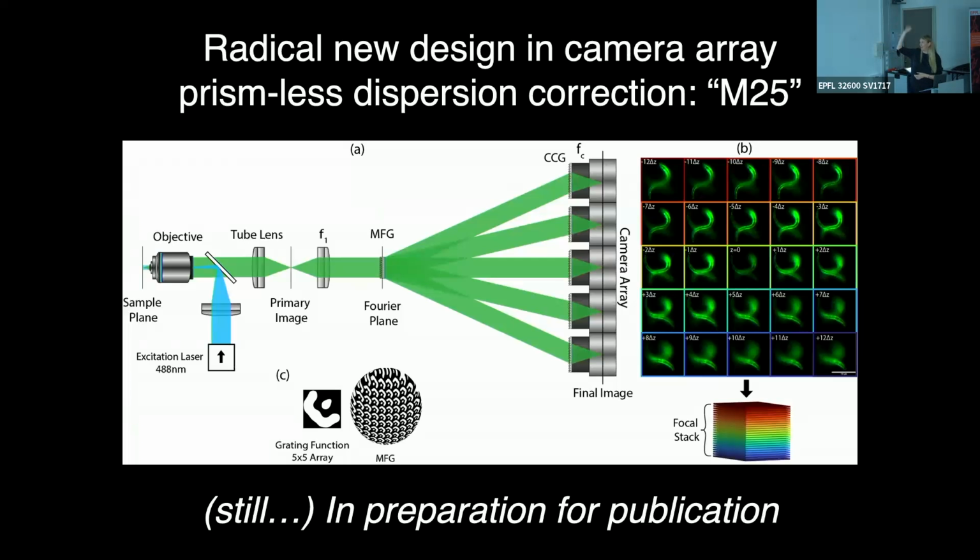So I think this is going to be super useful. I already talked to a colleague who is doing a compressed imaging application without this focus shifting grating, with just multiplexing the beam and overlaying planes. And you can use exactly this camera array for that. So this camera array, this is consumer technology, right? This is just machine vision cameras that you mount next to each other. And then you have that optics that you made in the fab together with your students, or maybe your students now can do them on their own.